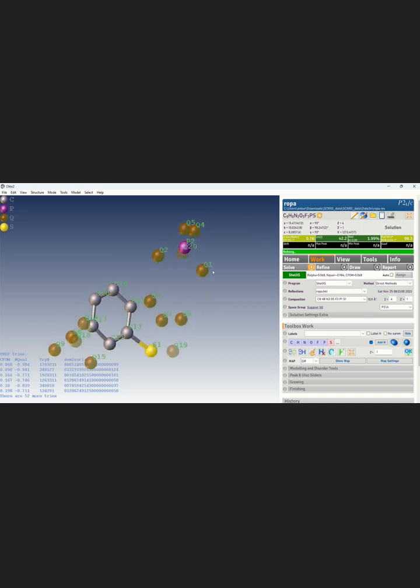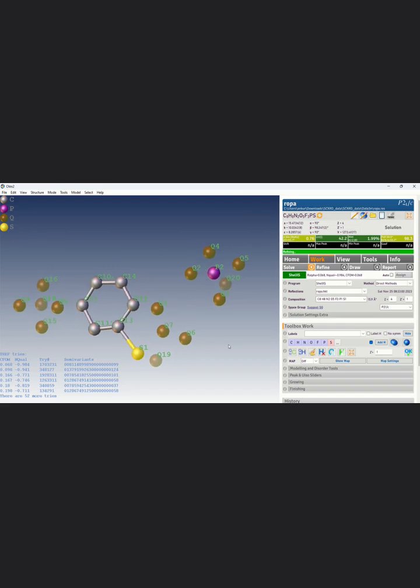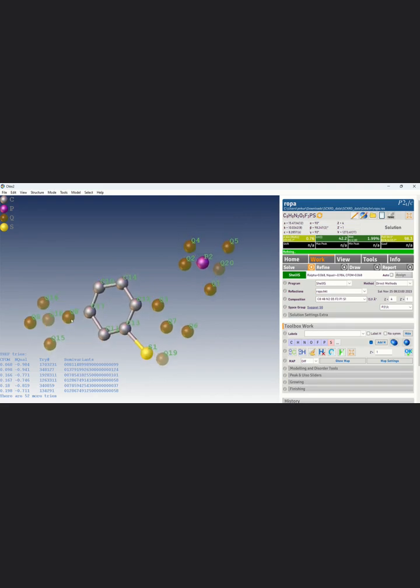Now you can see that this is making some connection. So this might be high density, so this I can denote as oxygen, and this is the phosphorus, so 5 oxygen, so 1 oxygen I have used here.